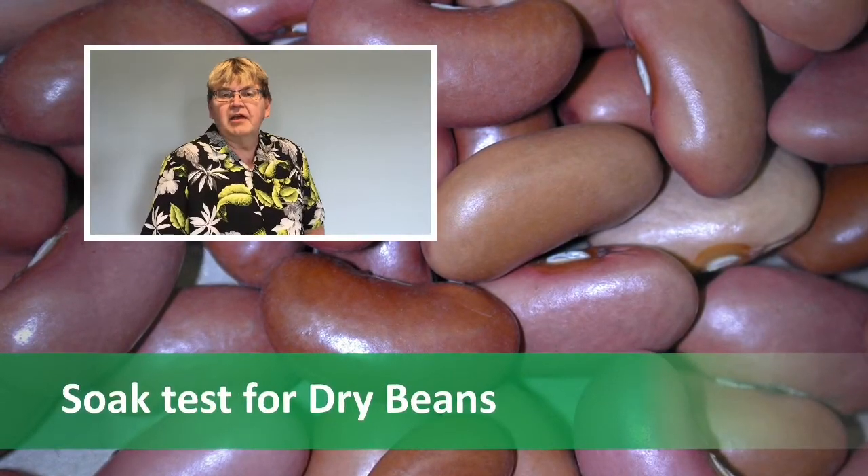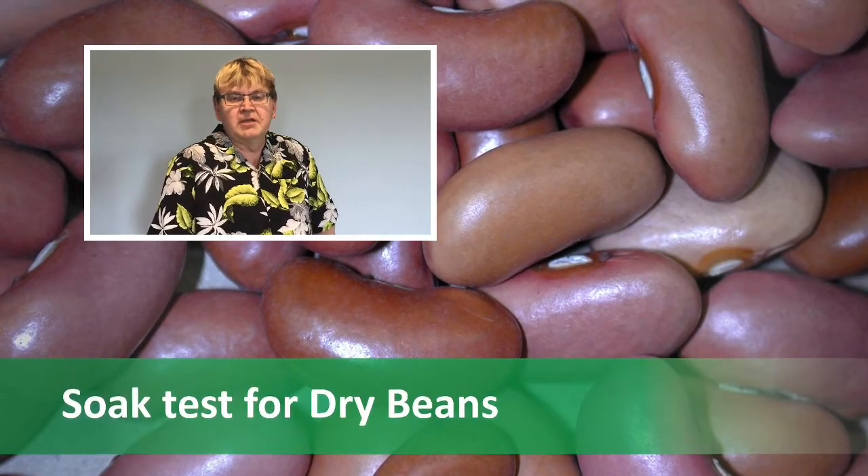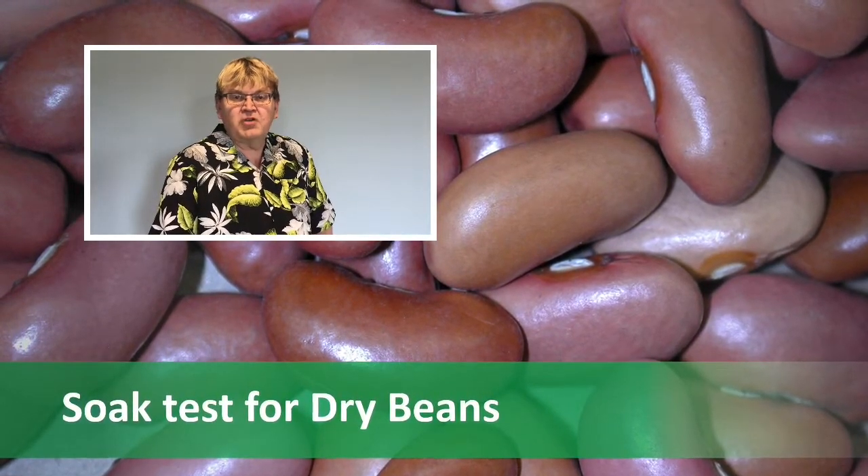Hello, my name is Dennis Lange. I'm the Provincial Pulse Specialist with Manitoba Agriculture and Resource Development. Today we're going to be doing a cracked seed coat test on some dry bean seed.